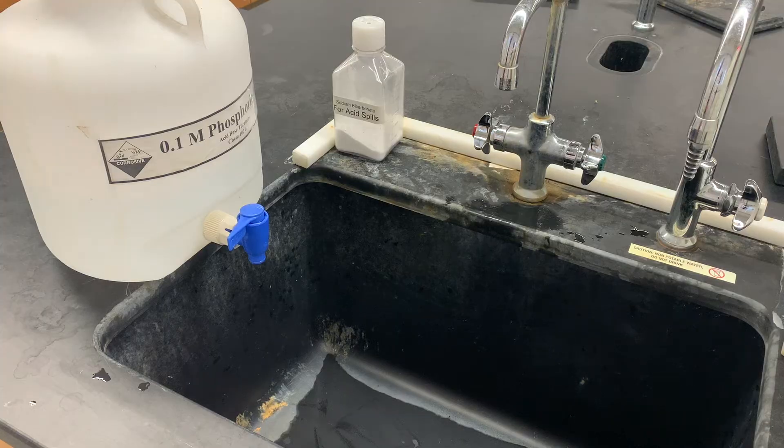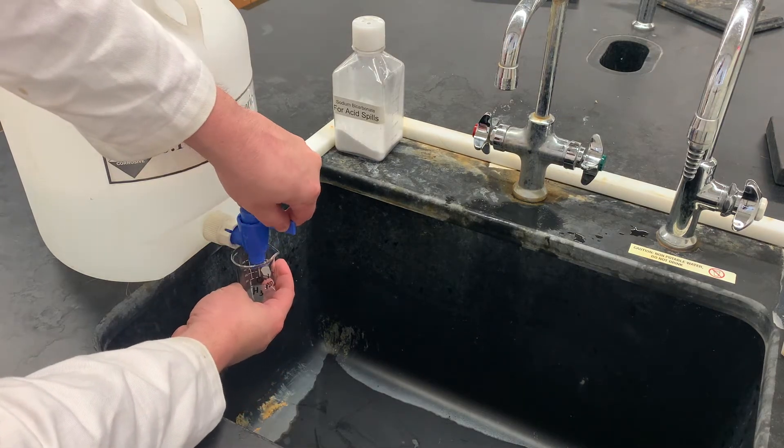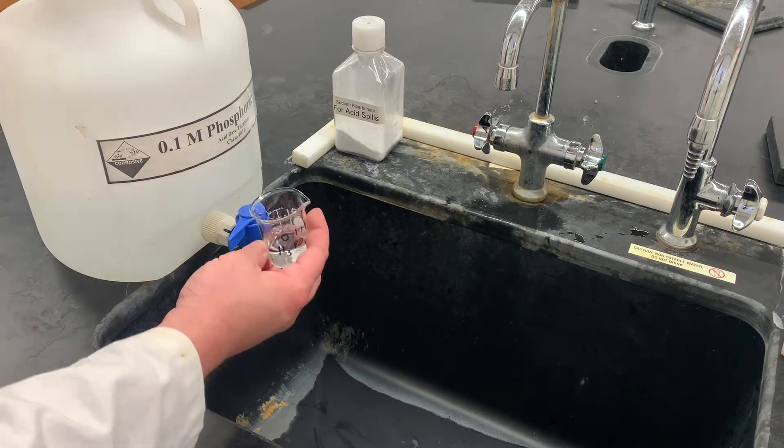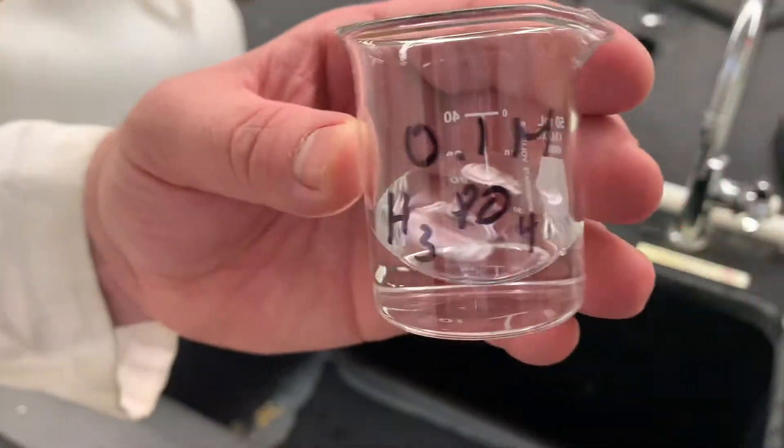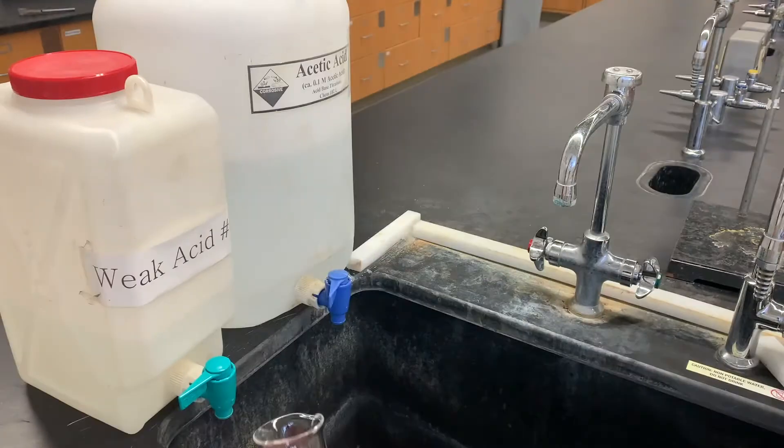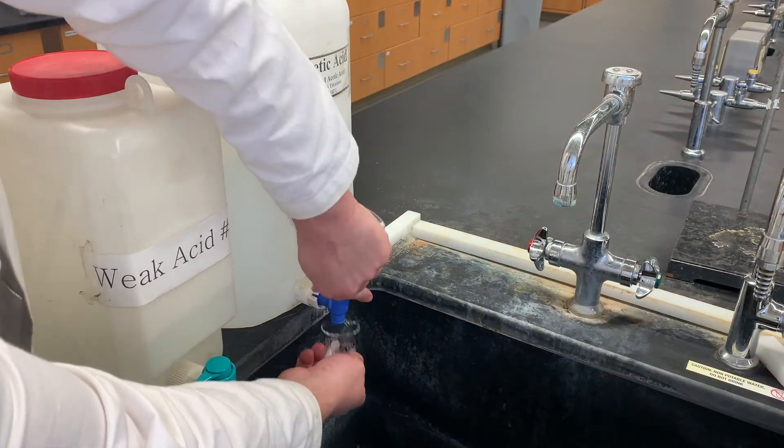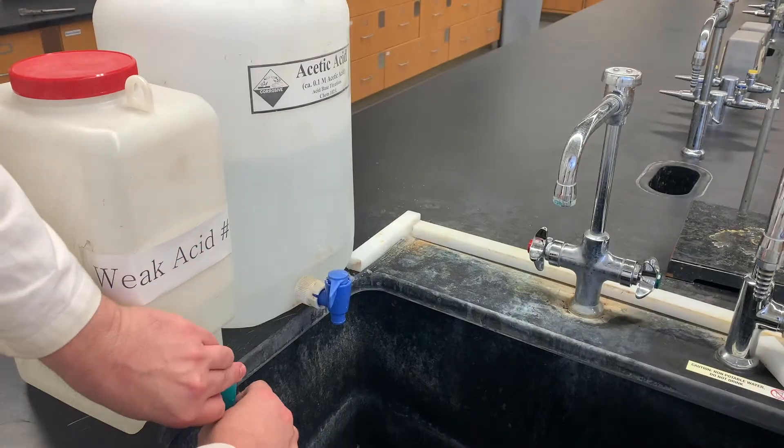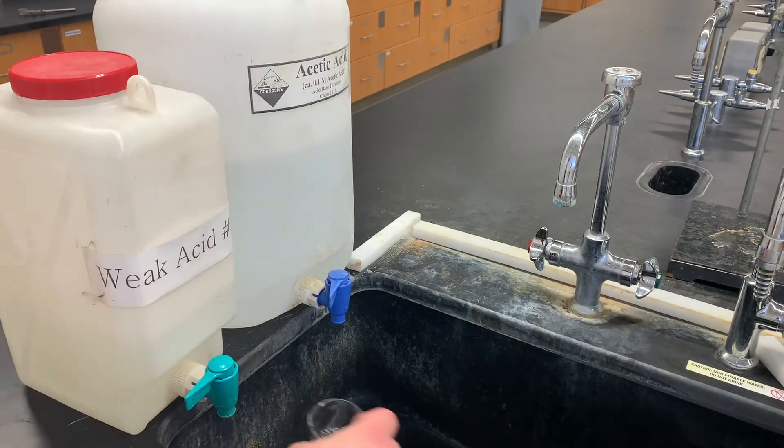We also grab some phosphoric acid. We don't need nearly as much. If it ever has trouble coming out, you might have to loosen the lid here. And at a different sink, we will need to grab our acetic acid, as well as our unknown weak acid. That would be right here. There should be plenty.